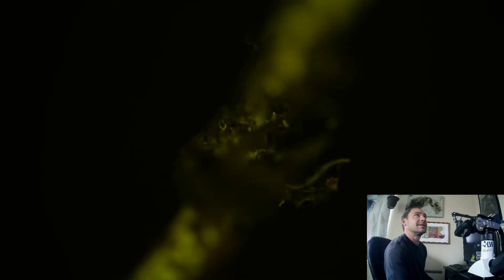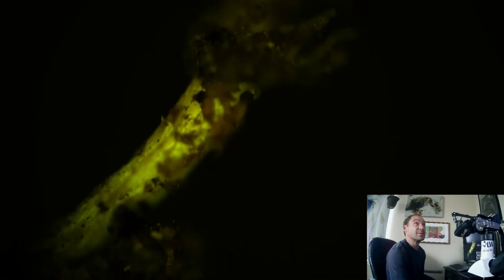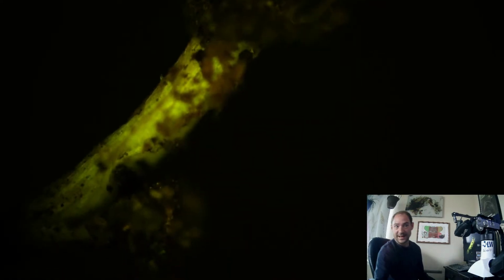But let's go back out to 100x. Get our focus back dialed in. And we got quite a few roots here to go through, so we can examine the differences between them. It's definitely a good beneficial. It's amazing how deep the roots will go, even a small dandelion that I picked out.